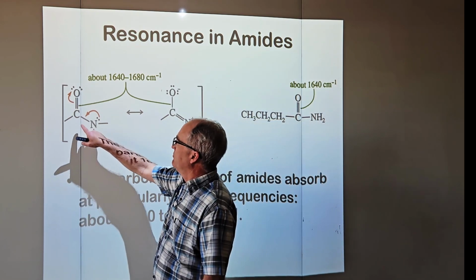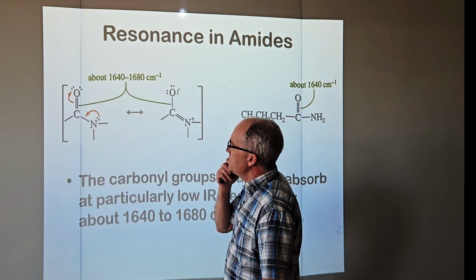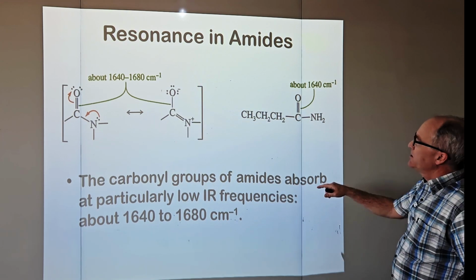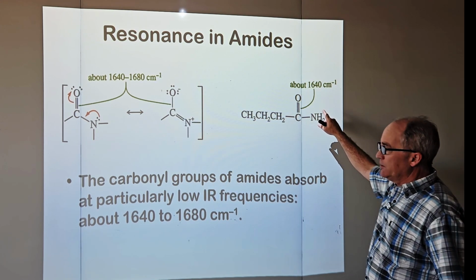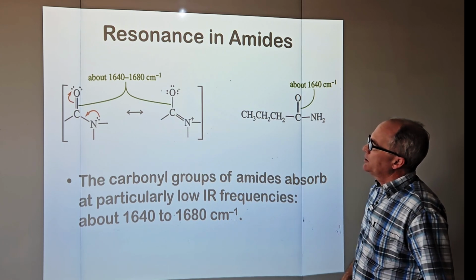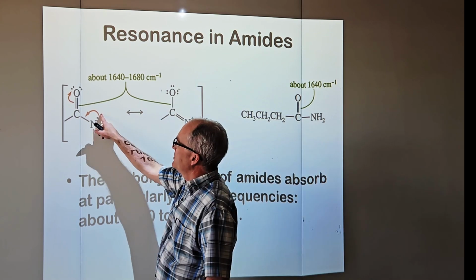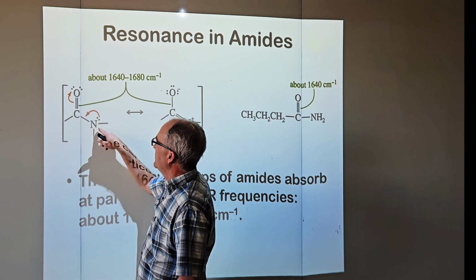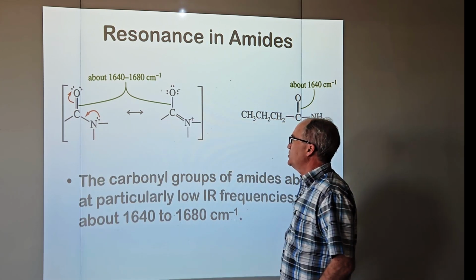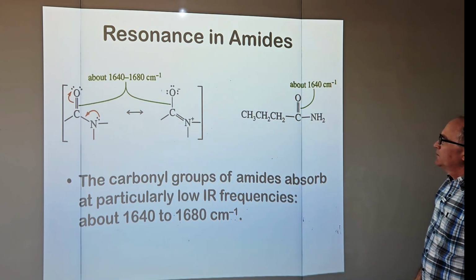So here is another carbonyl carbon, normal ketone 1720, and we see that these go even further to the right, a little lower wave number than the conjugated carbonyl carbon. Notice that looks pretty conjugated. Instead of a double pi bond here for electrons, we got a lone pair on nitrogen, and that can move over.